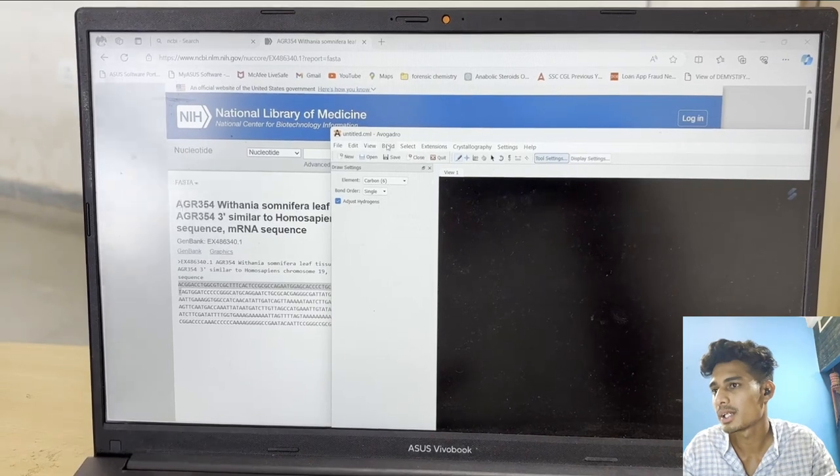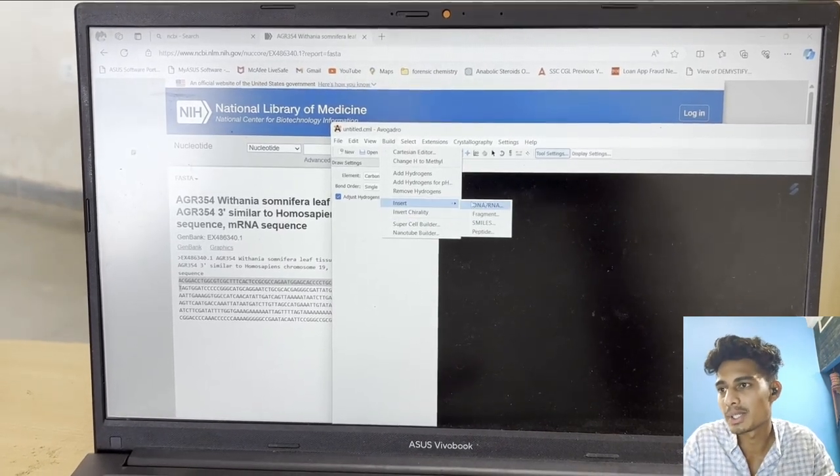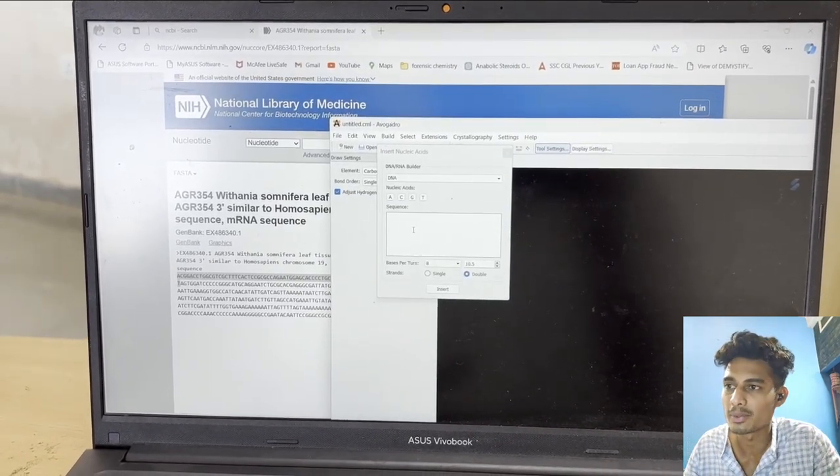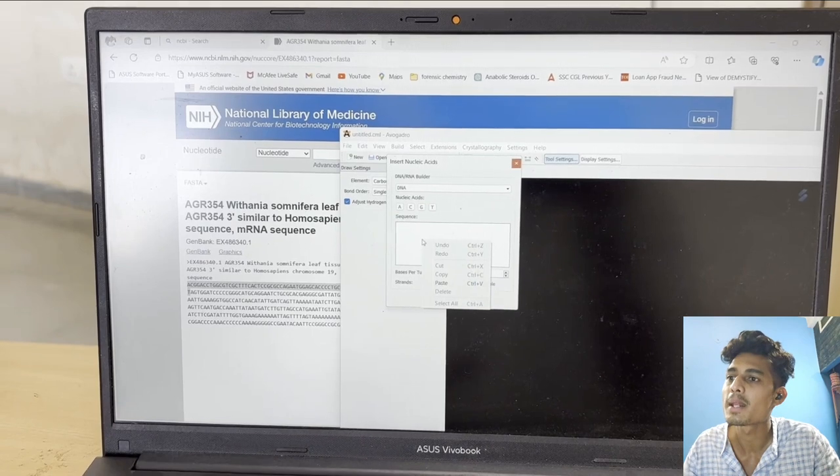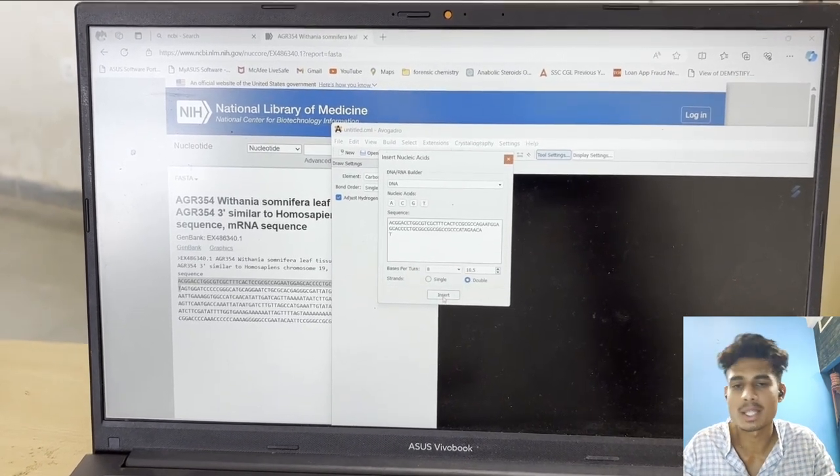FASTA format is used because the sequence is available in that format only. Then we are going to copy that sequence and use it in Avogadro.